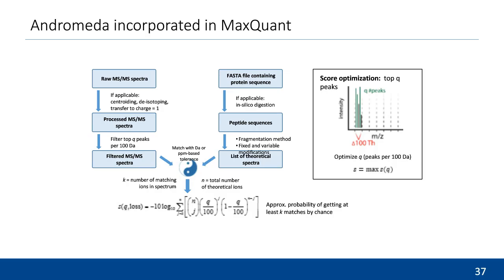And due to the time that seems to be proceeding faster than I was expecting, I will just mention another project that is still in the pipeline and soon to be released, and that the timsTOF PASEF will also benefit enormously from, which is the 2.0 version of the Andromeda search engine, which will have many interesting new features, like, for example, using the prediction of spectrum intensities in MSMS spectra from the peptide sequence, which can then be used to significantly increase the number of MSMS spectra that can be identified from each LCMS run and also from each LCMS ion mobility run.